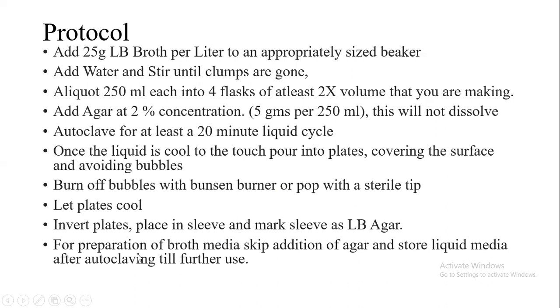Similarly, for preparation of broth media, a similar protocol is followed except we skip the addition of agar agar powder. After preparation of the media and proper labeling, we can store the medium until further use.